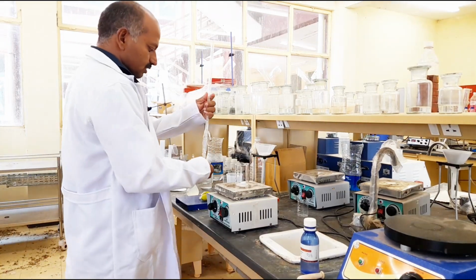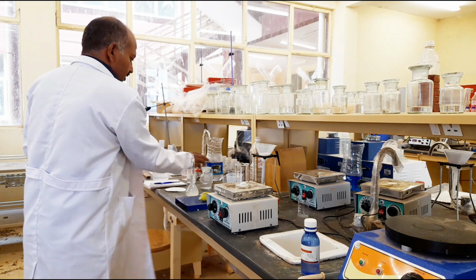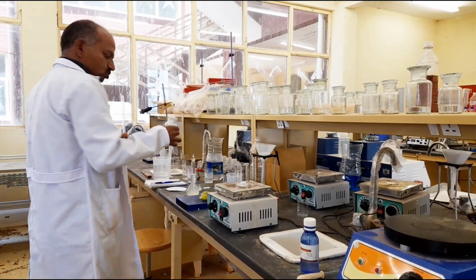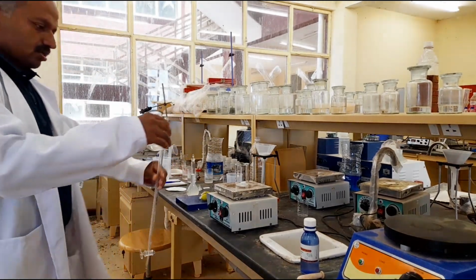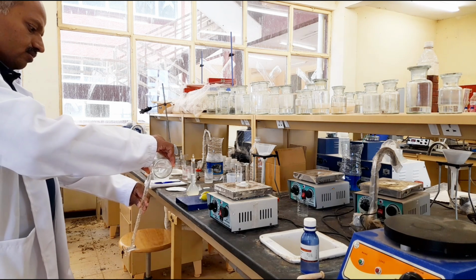Now we will perform the titration. This is the burette, a 25 ml burette. Now I am taking the sodium hydroxide, 0.1 molar, into this burette. Carefully.